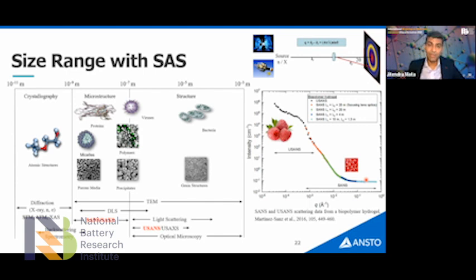But now you take this keyhole and go to the other side of the room, which is the ultra small angle neutron scattering. Now you can see a whole bunch of elephants. You can say, okay, what is their volume fraction in terms of numbers? You can see who is smaller, who is bigger, but probably that's too far to see the smaller features. So by having this combination of SANS and USANS, you can resolve the structure at all the length scales in one go. That's the beauty. Now more and more papers are coming out which combine these two techniques and give you this information. So that's SANS and USANS combined.